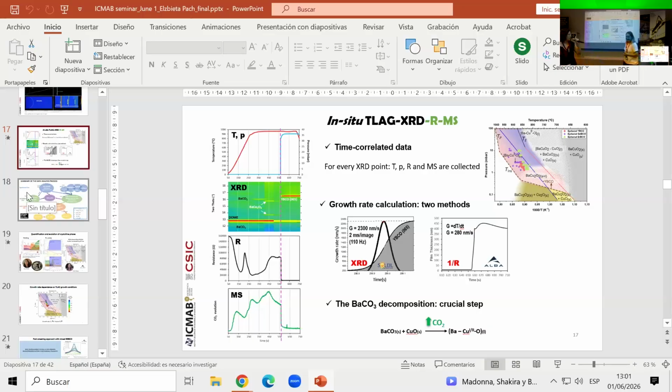The most important thing about the resistance is that it allows us to really synchronize all the experiments from different beamlines and also from our setup here at ICMAB. Because in every place we have the in-situ resistance, also here at ICMAB, and therefore we really can know where things are happening, because we have a single measurement synchronization. And the shape, everything is the same.